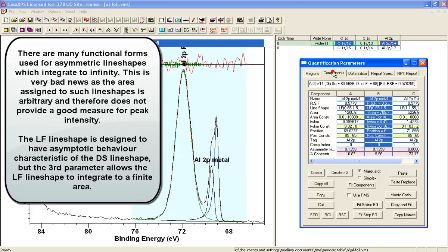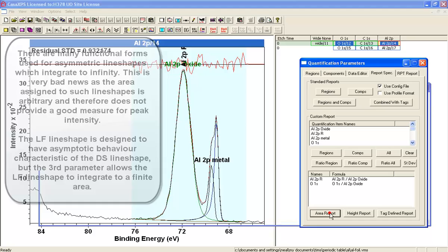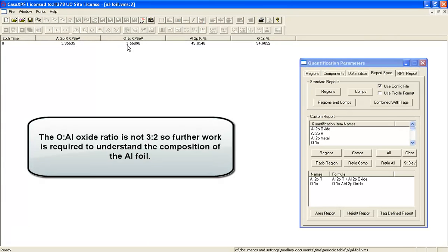So having done this, let us go back to the custom report and let's re-evaluate what we've got here. And now that's interesting because having improved the quality of the fit, we now have got the value apparently getting worse. So it's 1.66. We're expecting 1.5.